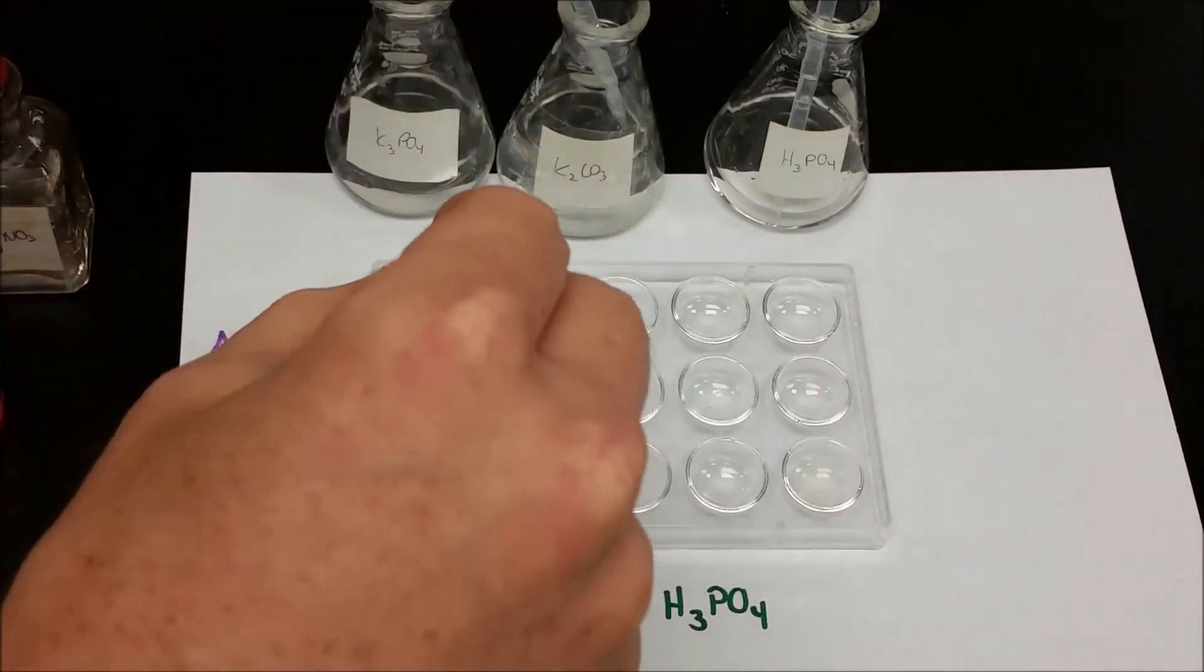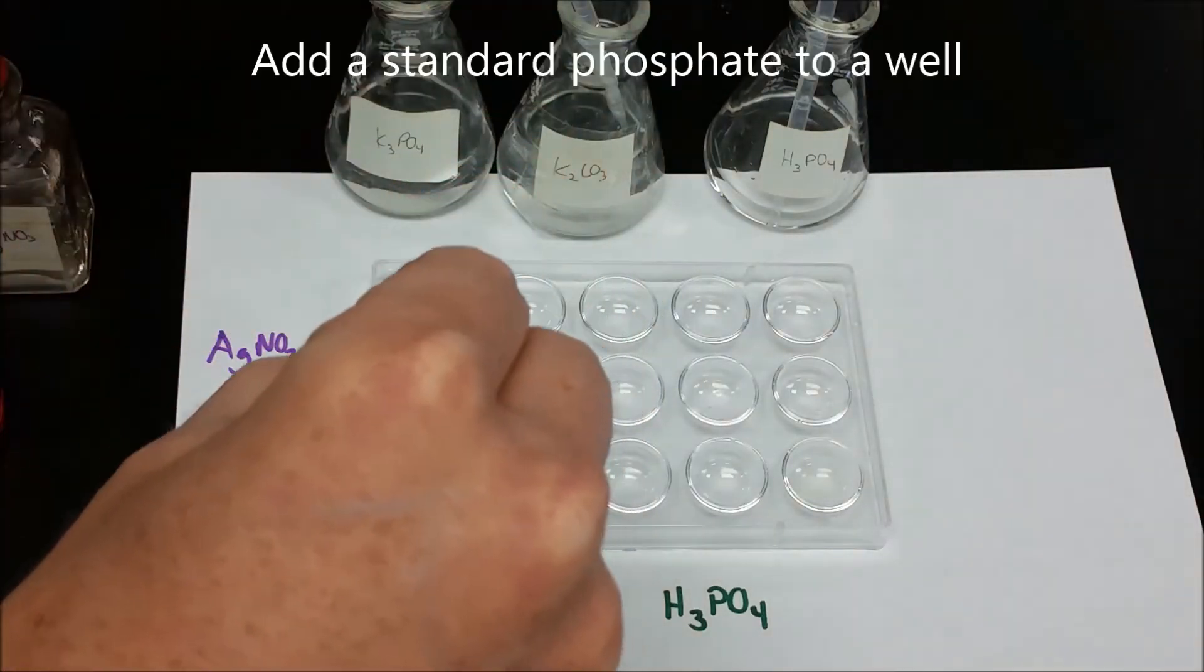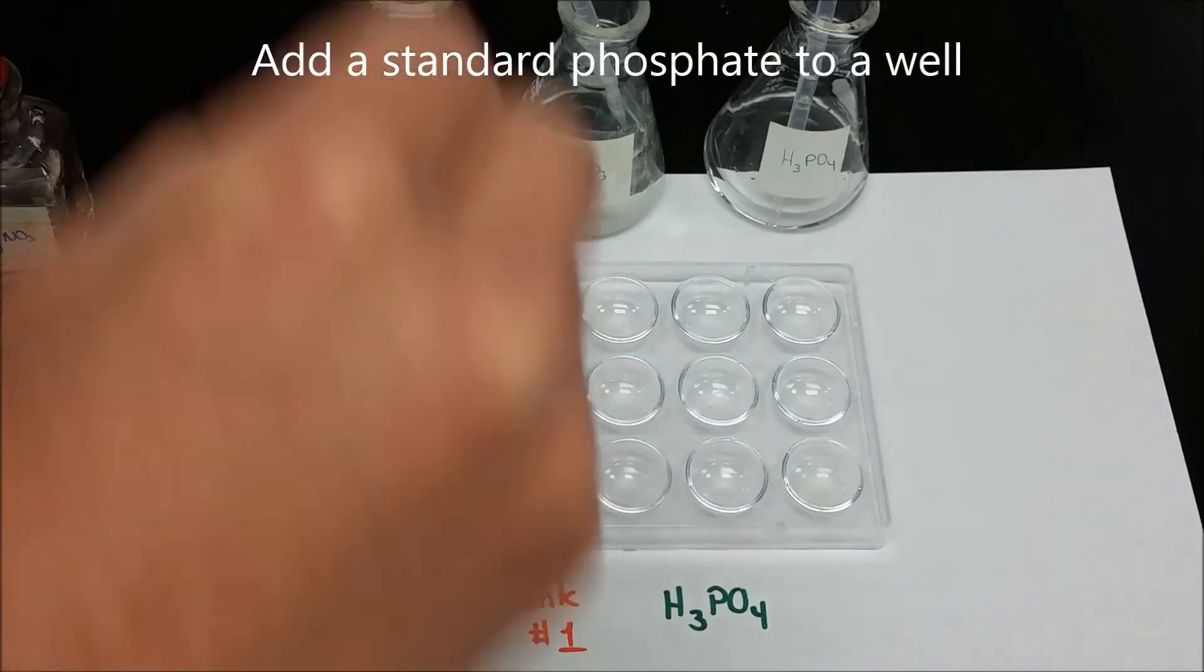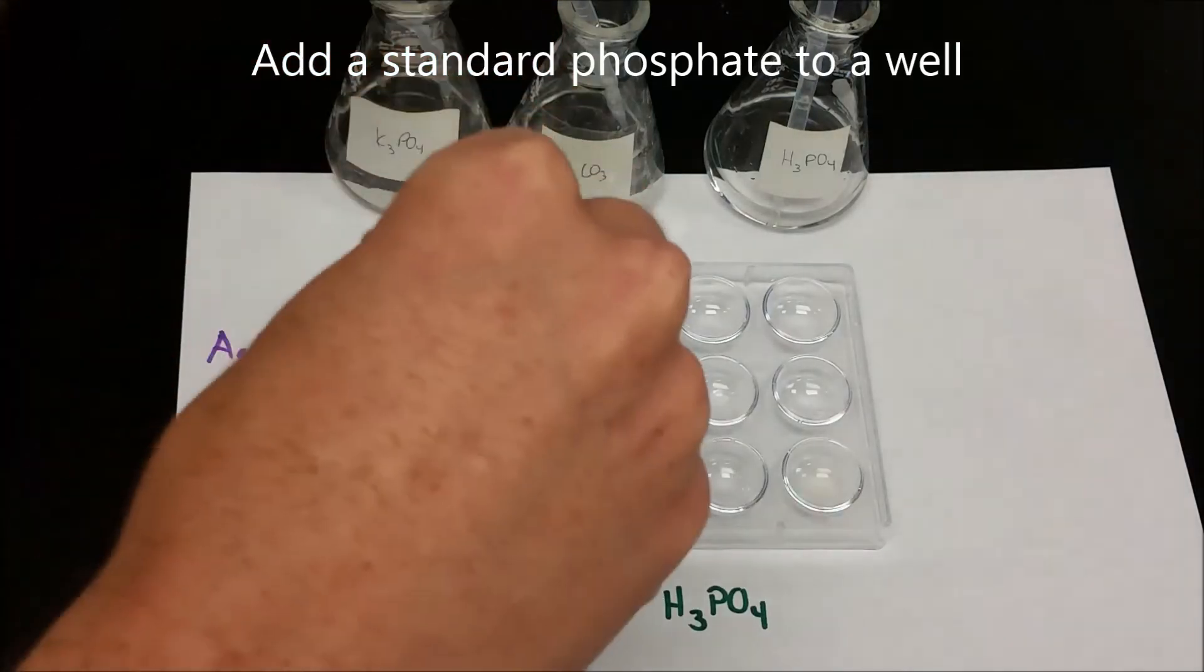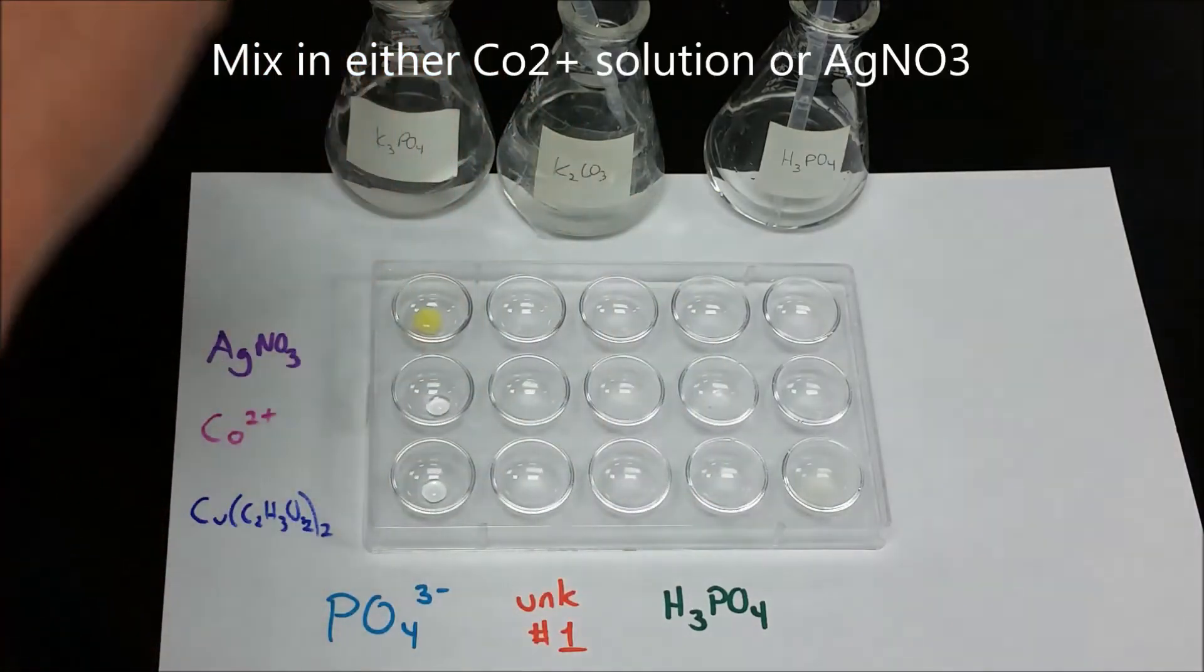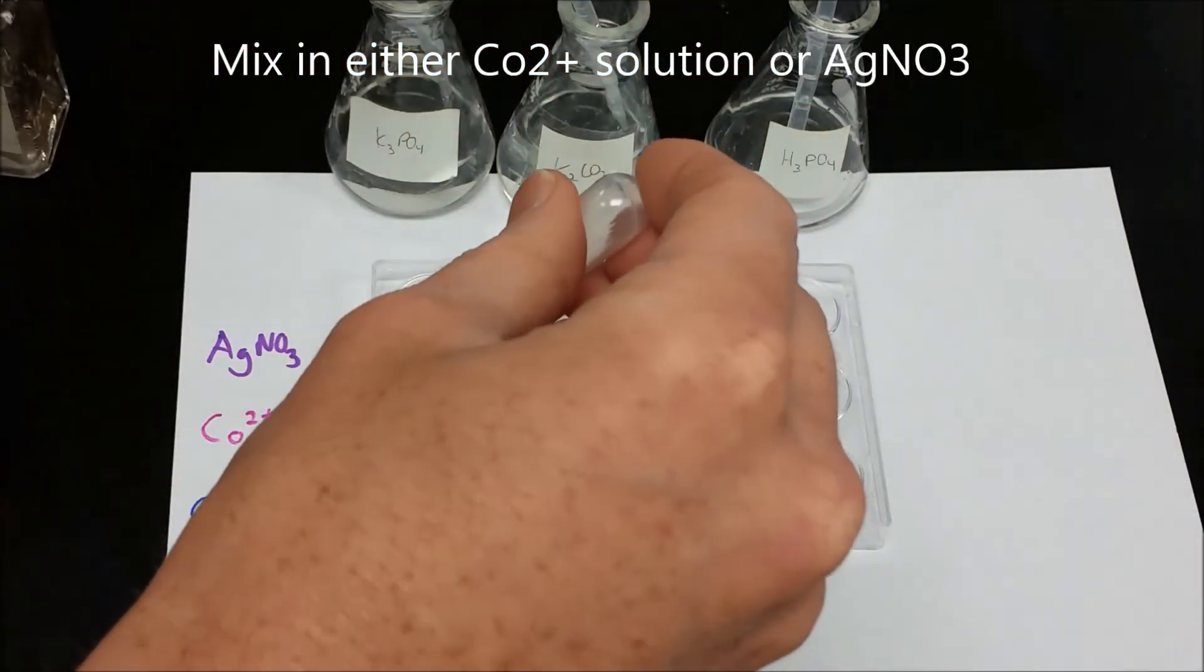In the phosphate test we want to do a couple steps. The first one is we're going to check to see if there's a phosphate. To do that you have two options: you can either try silver nitrate or you can try adding any cobalt compound.